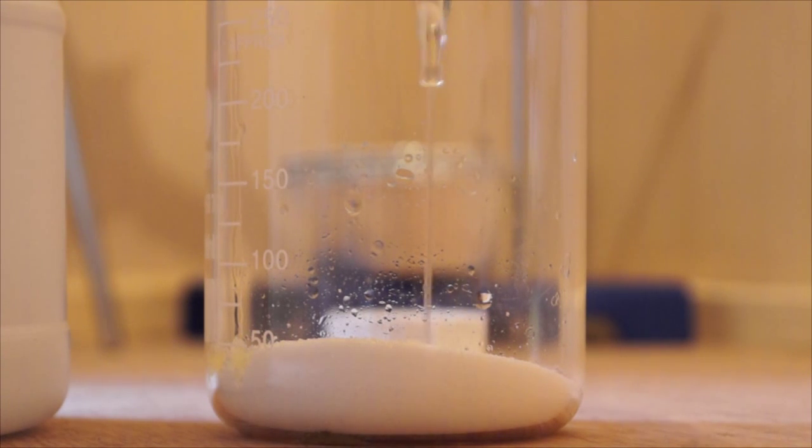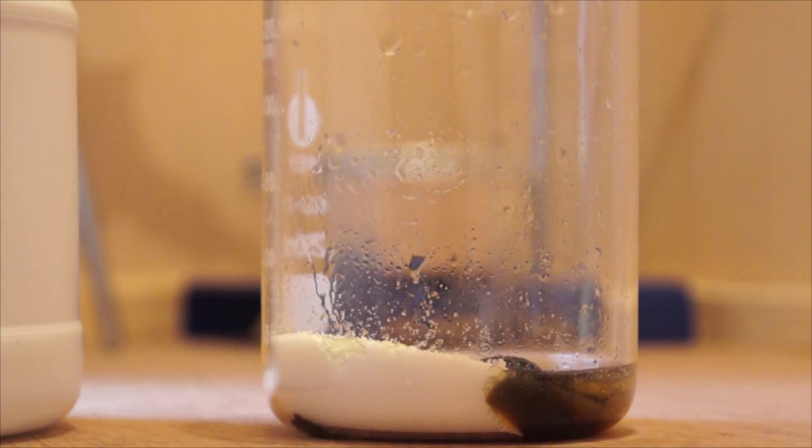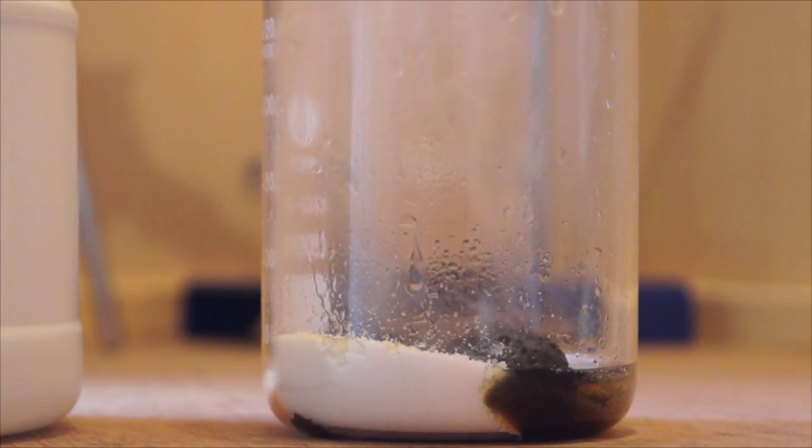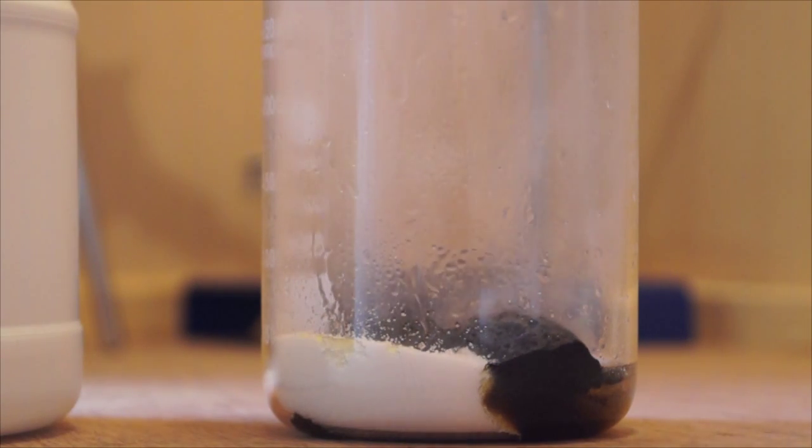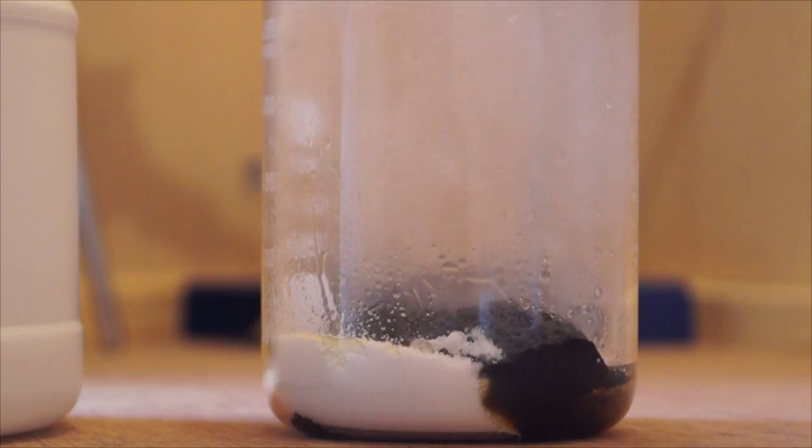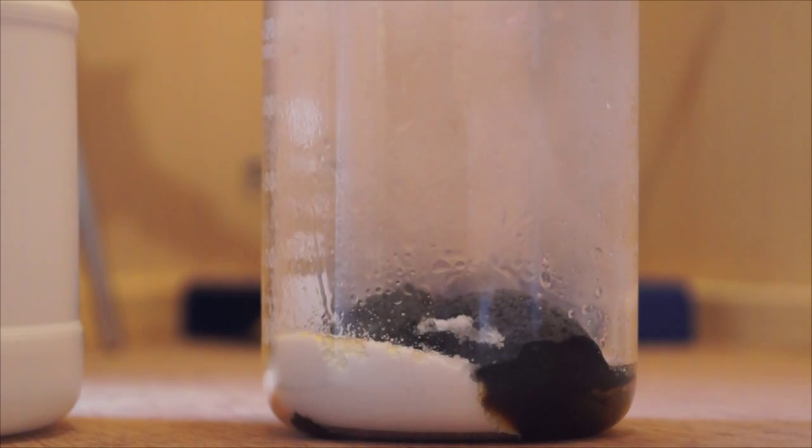Carefully add the sulfuric acid to the sugar and watch the reaction take place. As you can see, a black solid is formed and seemingly grows out of the beaker. I used very little sugar and acid, thus the snake that grew from the beaker was very small as I didn't want to create too much of a mess.